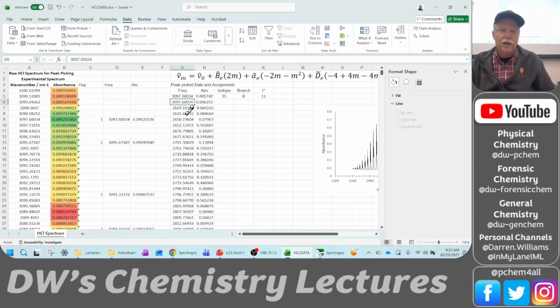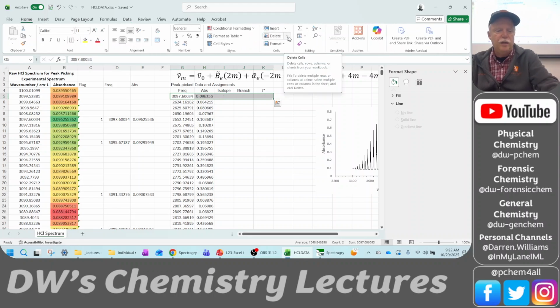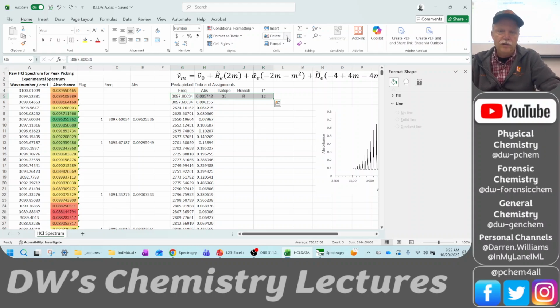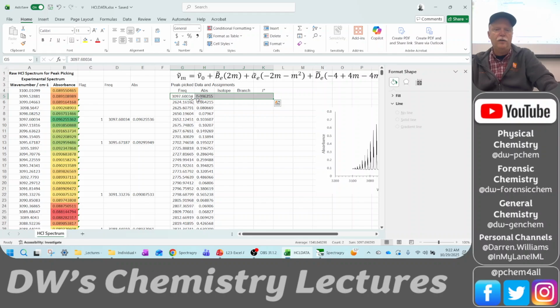You can see this is the 3097.6 peak, and so we can just delete that guy. When you delete cells, it shifts the cells up, like that. So it deletes, and there we go.